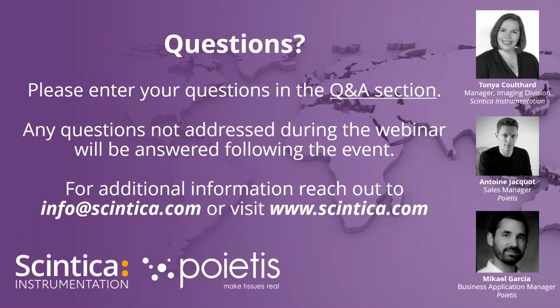Mikhail, is there anything you want to add to that? Yes, I just wanted to add that, yes, I said that it was a usual cabinet, but contrary to a usual cabinet, when you close the window, of course, the flow stops. In our case, it's adapted, meaning that the flow doesn't stop. It's adapted to the fact that the glass is down. So sterility is maintained. Got it.